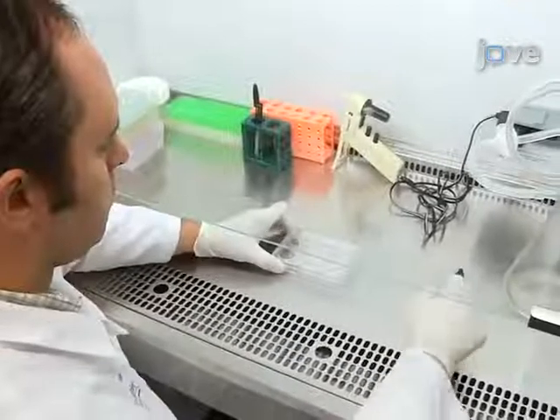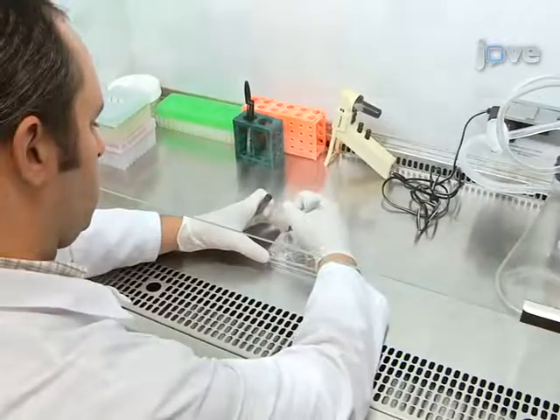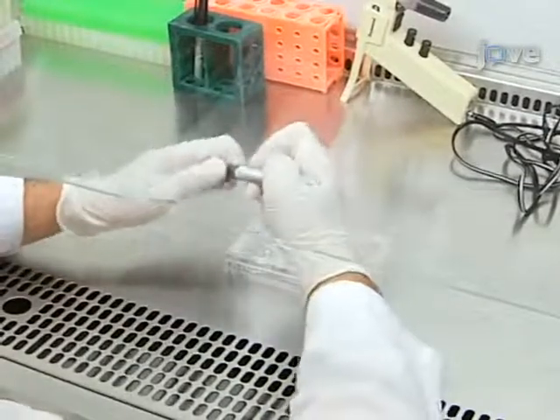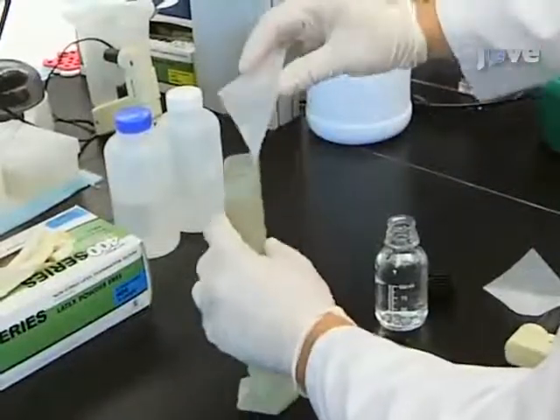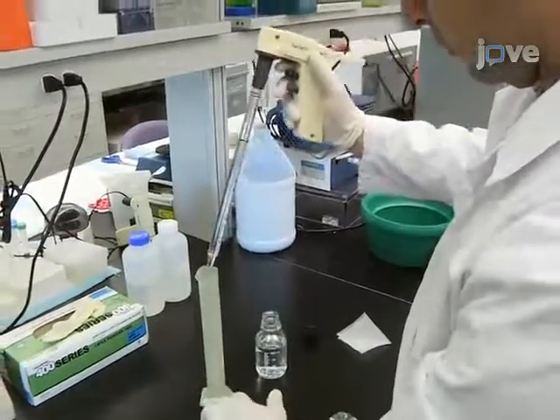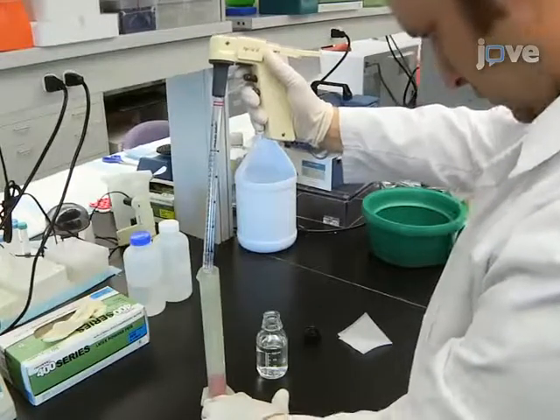Begin the procedure by labeling each well of a tissue culture-treated six-well plate appropriately for each cell line or condition being investigated. Next, prepare 2X cell culture medium by dissolving 1 gram of powder medium and 0.2 grams of sodium bicarbonate in deionized water to a final volume of 50 milliliters.